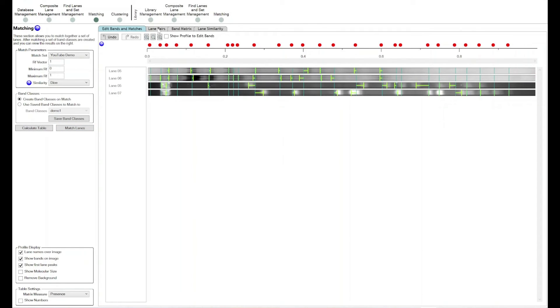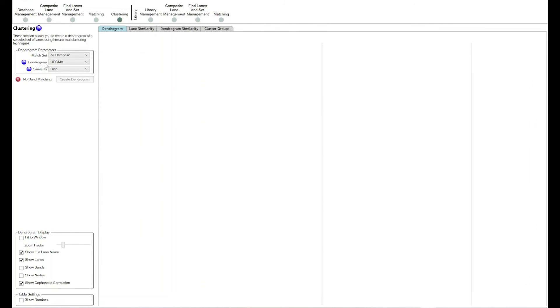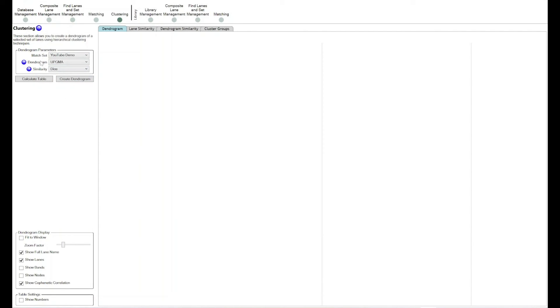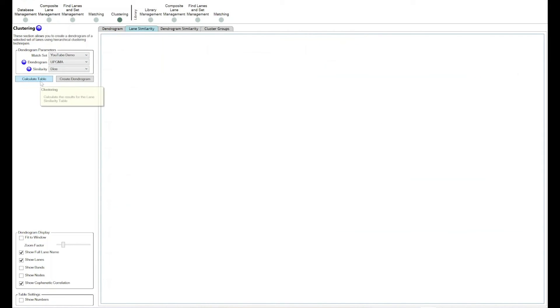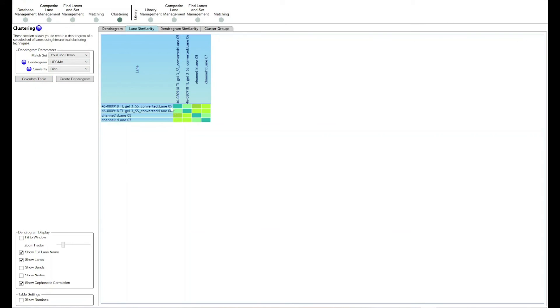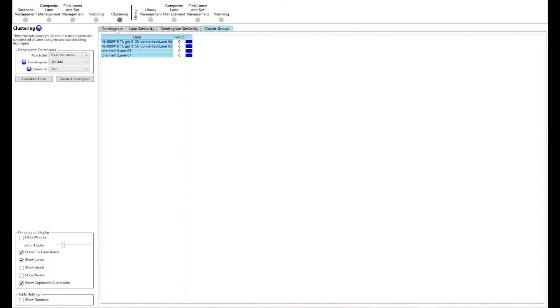If you want to generate a dendrogram or get a similarity score for these four lanes, move through to the clustering tab. Where it says 'Match Set,' pick your set — for this demo, the YouTube demo set. Select your settings for similarity and dendrogram creation, then click to create your dendrogram. You'll get a dendrogram showing similarity between your different lanes. If you want the similarity table, click 'Calculate Table' and you'll get lane similarities, dendrogram similarities, and cluster groups for your different bands.